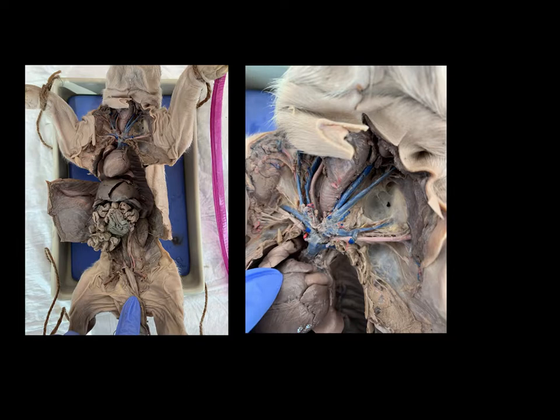So let's see the veins of the upper chest and neck that we need to learn. If you look in your lab manual, I believe it's page 5, you'll see a list of the veins that you need to know. I'm just going to go down that list on this image and show you where each of these veins can be found. Now remember, keep anatomical position in mind. When we're talking right and left, it's not what's on your right, it is the right of the pig. So everything over here will be right. Everything over here will be left.